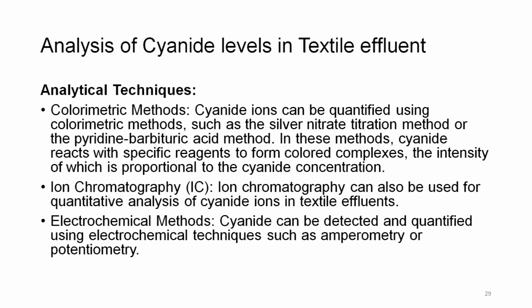Electrochemical methods. Cyanide can be detected and quantified using electrochemical techniques such as amperometry or potentiometry.